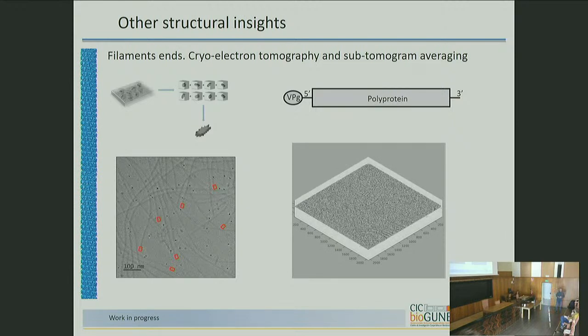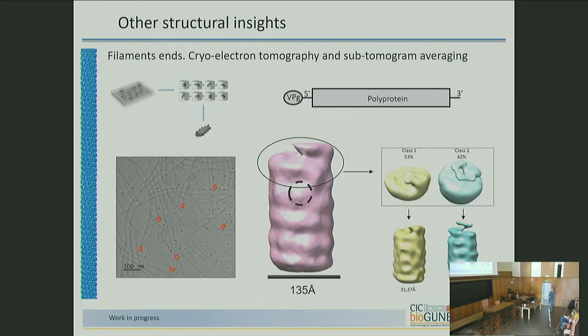So with, I think it was 80 tomograms or something like that, we collected around 600 ends, which is really a poor number. But it was just kind of a proof of principle to see whether we could get something. So the final average we got is this one. We always had around 30 Angstrom, which is really bad if you want to go into details.